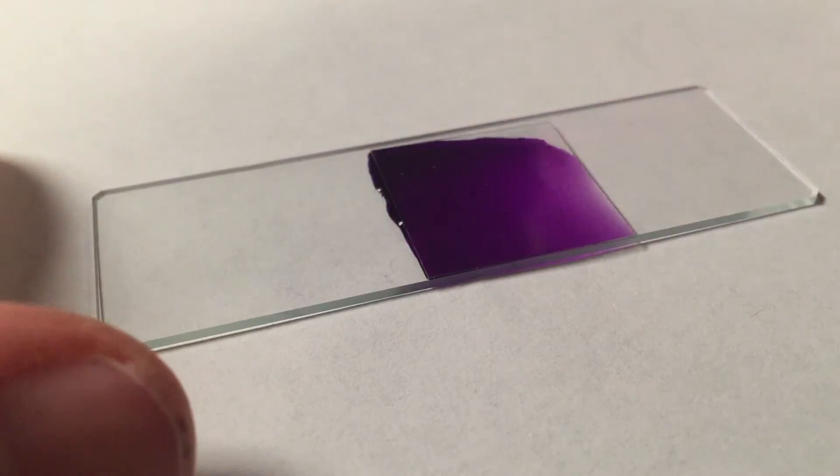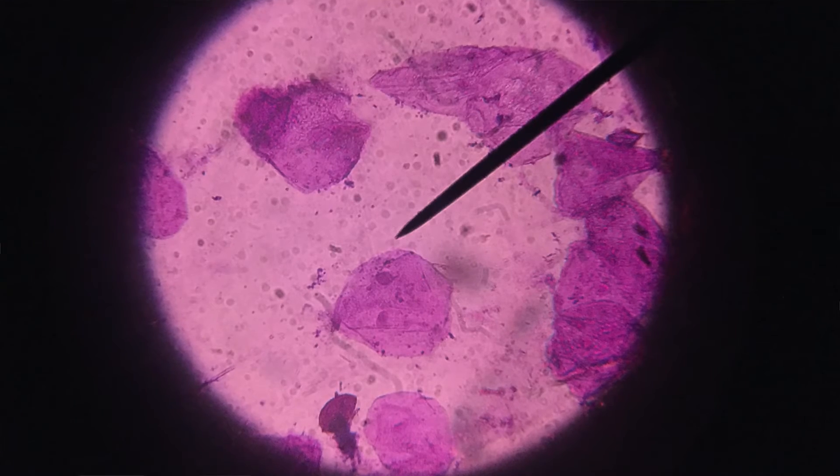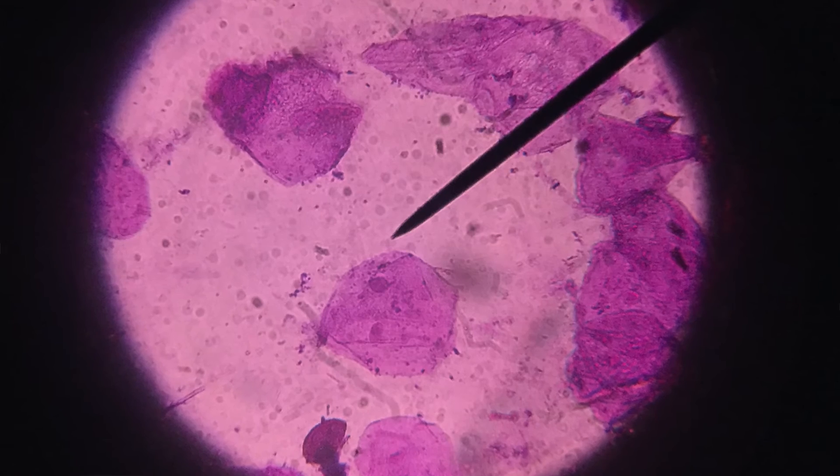You should have had a nice slide prepared. We saw how you just use a little toothpick, do minor scrapes on the cheek, smear it on the slide, add diluted crystal violet, put the cover slip down at an angle to reduce air bubbles, then put it under the microscope. We saw the cell membrane — that outside layer that lets things in and out — the cytoplasm, the fluid part of the cell, the vacuoles which are the tiny little storage circles, and probably one of the most important parts: the nucleus. We generally say it controls the cell, but we are going to go into way more detail on how it actually does that, which is also fascinating.